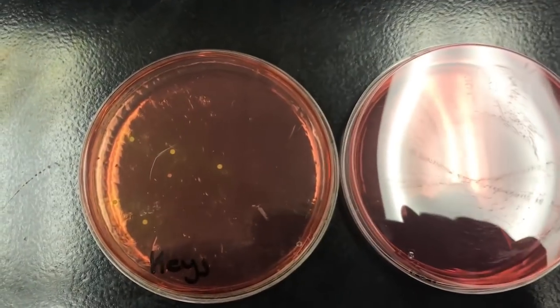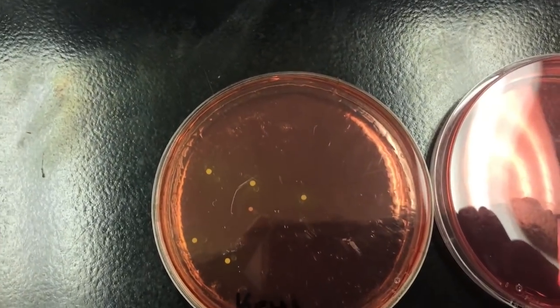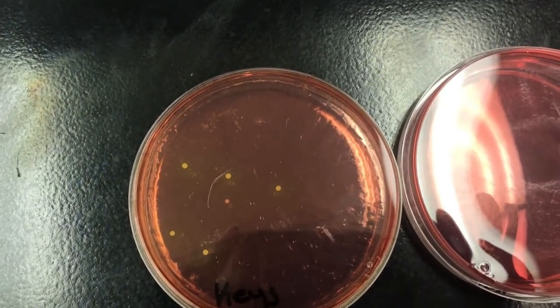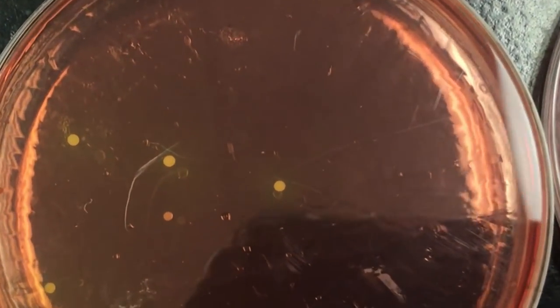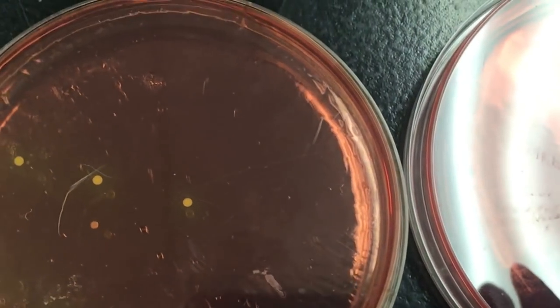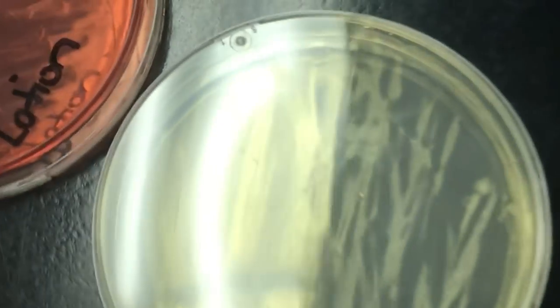Before I do that, these are what the plates looked like. You see the yellowing of those colonies? That's because the Staph aureus bacteria eats the sugar in the plate. The sugar that's in it is called mannitol. When it eats the sugar, it puts out acid, and that's why the plate starts looking yellow around it. So that's what makes me say Staph aureus. Jasmine's just gonna do a simple stain to show you what Staph bacteria looks like, and Janaya is going to pick a bacteria from her plate just to see what they look like.